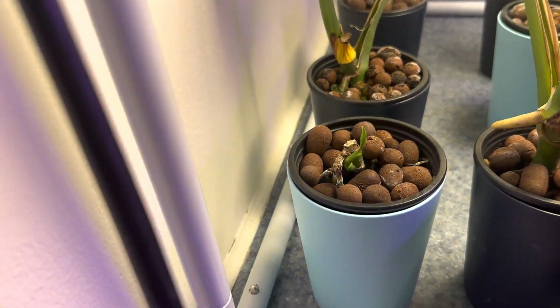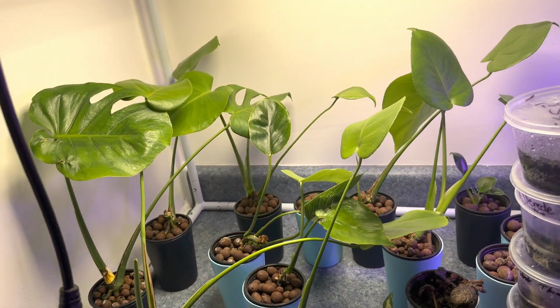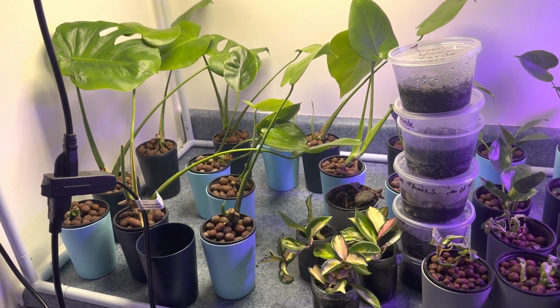You can even see we cut this one, and it's growing a new shoot. Well, these are the ones that we cut. I mean, there are plants that are just growing outside of tissue culture. We cut them and we place them in tissue culture, and now they are growing in sterile conditions.